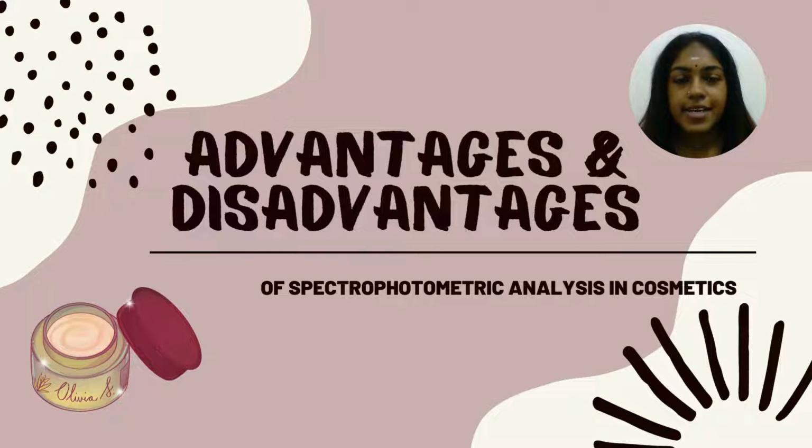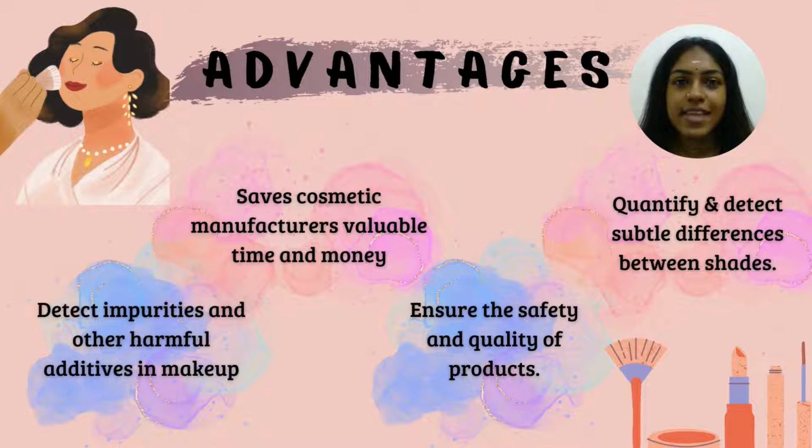There are some advantages and disadvantages of using spectrophotometry for the chemical analysis of cosmetics. First, let's have a look at the advantages.